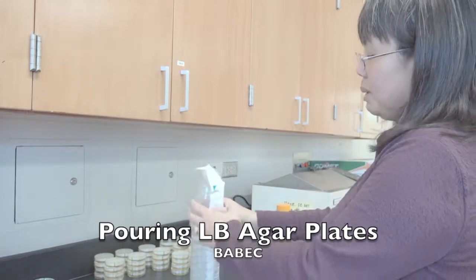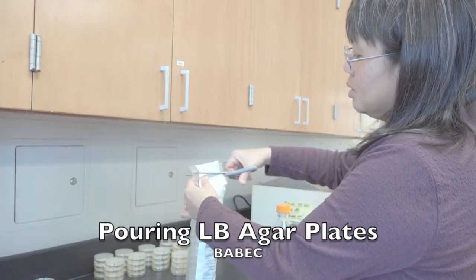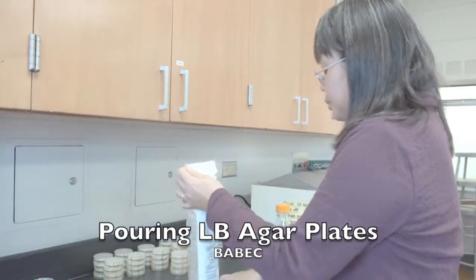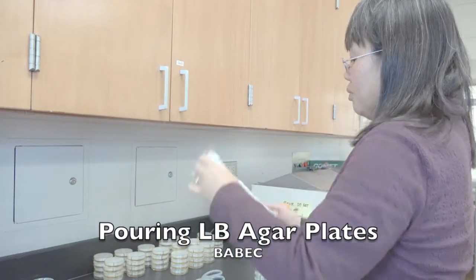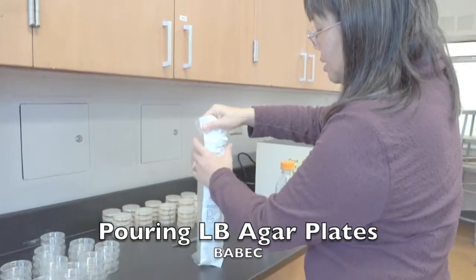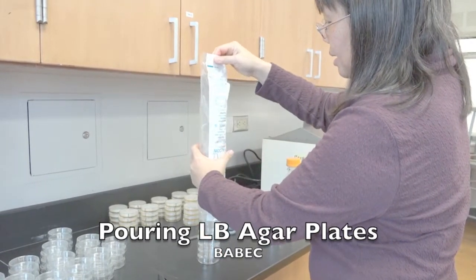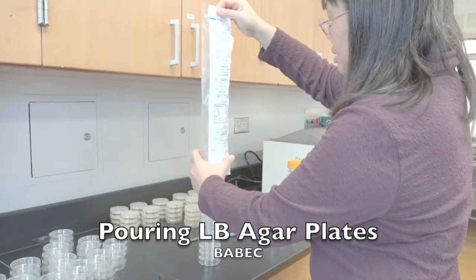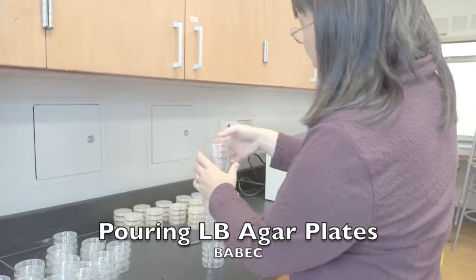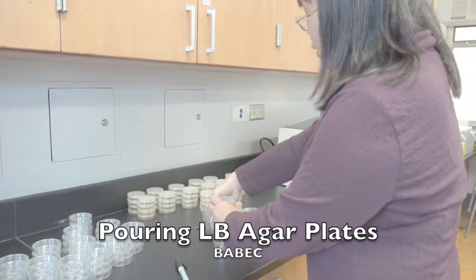Each sleeve holds about 20 plates. What you do is cut it as close to the top as possible so that there's room on these sleeves, and you're going to reuse these sleeves. Then you slowly tip it over and get all the plates out of the sleeve itself. Once you have the sleeve off, I like to separate them into sets of four, so you have five piles of four plates.